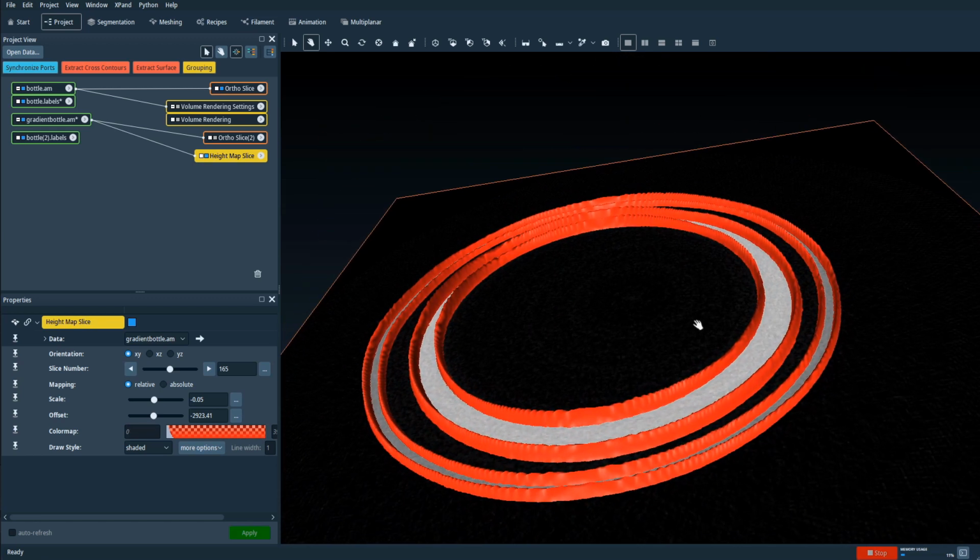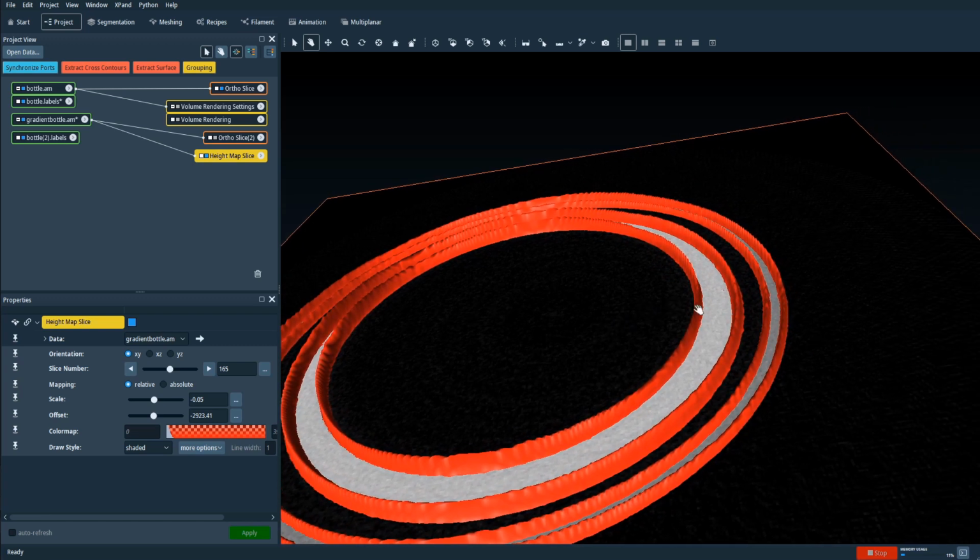What the watershed algorithm does is you can imagine that if we have markers for the bottle over here, you have markers for the air material here, and markers for the cap over here, and again markers over here and here for the air. Imagine that these markers become fluid sources. Let's say water starts flowing out of these markers, and the water is color-coded according to the material they belong to.